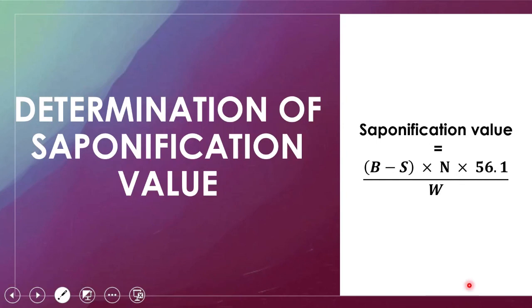Today, we are looking at the determination of saponification value. We'll start by looking at the definition of saponification value.